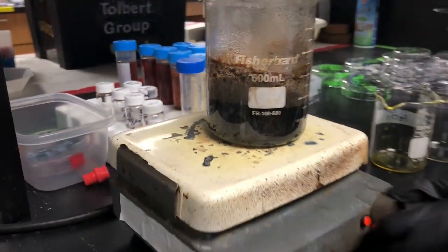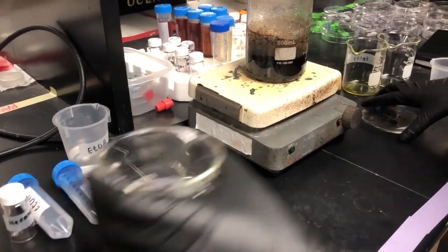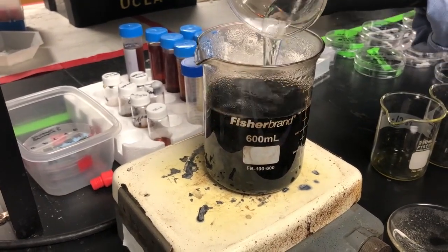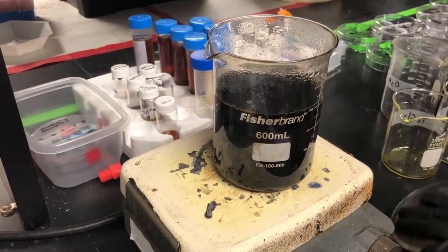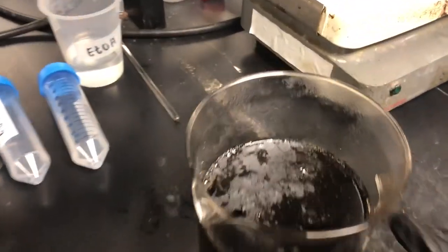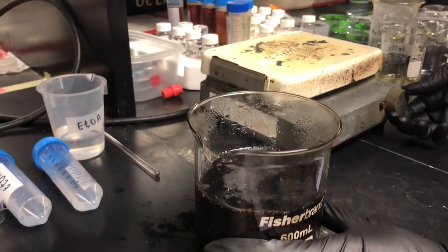We'll first add the water to cool it down. This just makes it a little bit easier to hold. Make sure your students are not going to burn themselves. If everything's done right, the lid or the rim of the beaker should be fairly cool to the touch. So we can now take that off the hot plate, and you can already see some of the clumps that have developed both on the top and on the side.